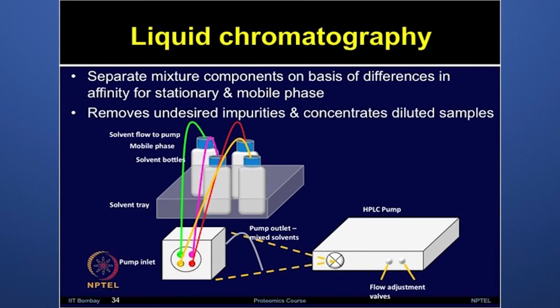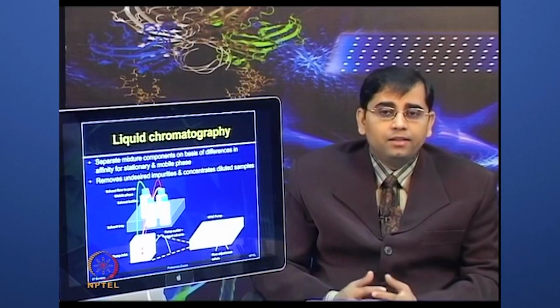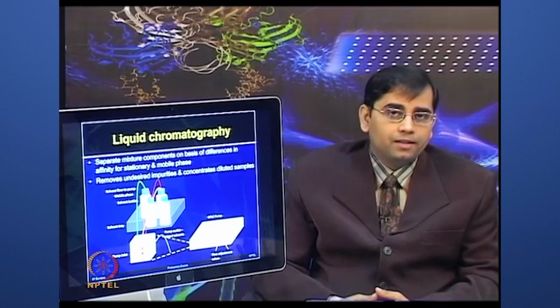One diagram is shown here, which is a typical liquid chromatography setup, which consists of solvent bottles, degasifiers, dual or quaternary pumps, the sample injector, column and detectors. Different solvents can be placed in the solvent bottles depending upon the purification requirements.